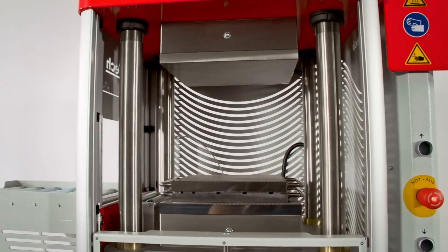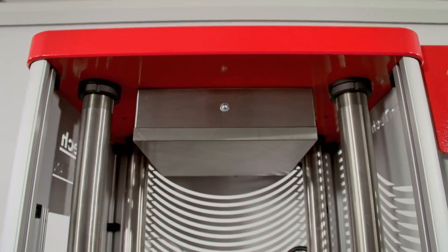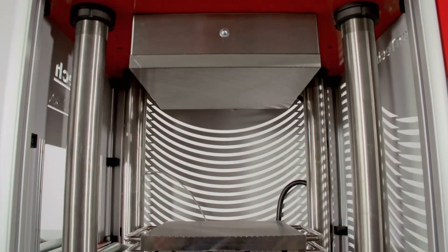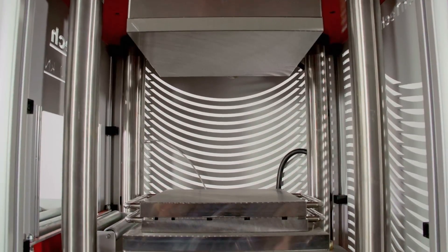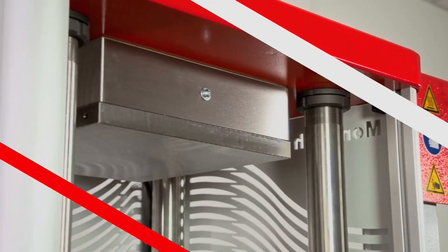The LP3000 applies force using high efficiency, low noise hydraulics, requiring as little as 8 to 15 liters of oil. Its plates are heated using an electric PID controlled heating system. Each plate has its own heat control circuitry and temperature sensors, ensuring consistent curing conditions.